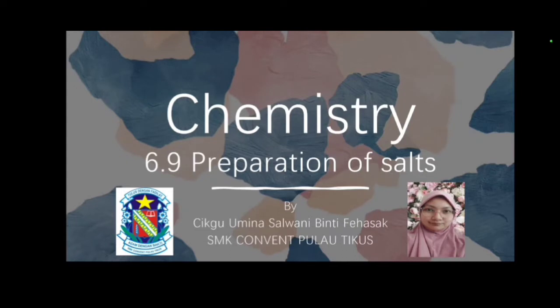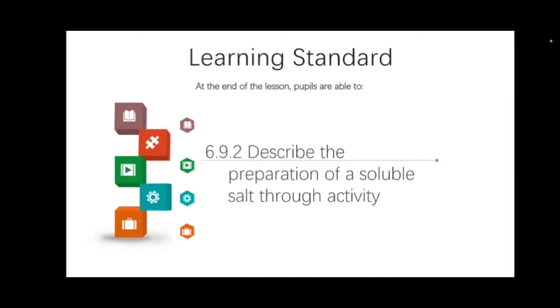Today, I will guide you to carry out an experiment from subtopic 6.9, Preparation of Salts. At the end of this lesson, a student should be able to describe the preparation of a soluble salt through activity.